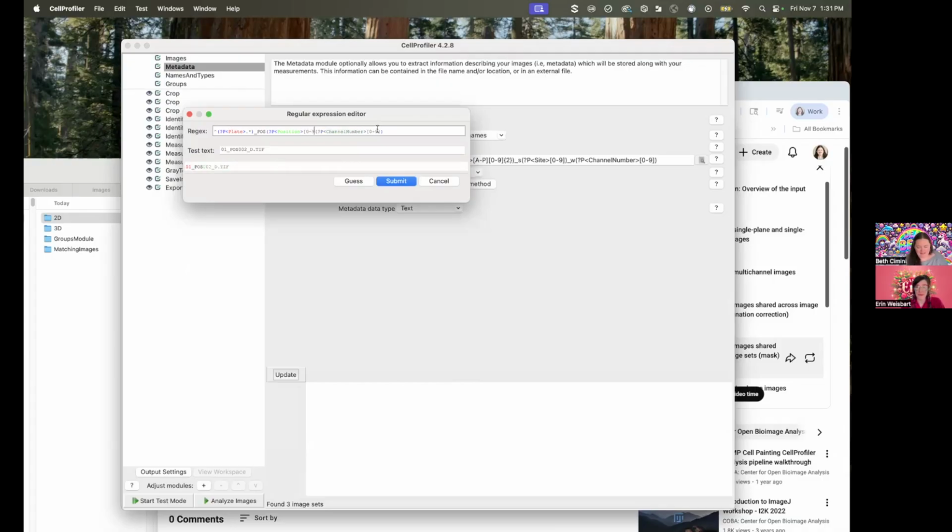I can second that because when I started in the lab over 6 years ago, I had to make Beth drop into a Zoom call with me every single time I was trying to change the regex for my pipelines, but with some practice, I pretty quickly got able to do it most of the time myself. It is not entirely unintuitive once you get used to it. But it can also do quite complicated things that are still beyond my abilities.